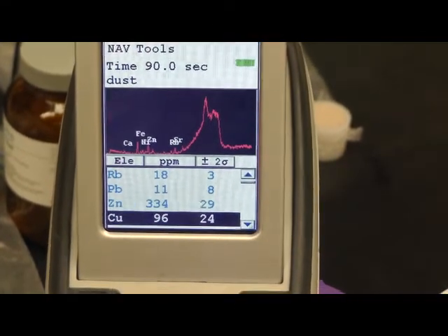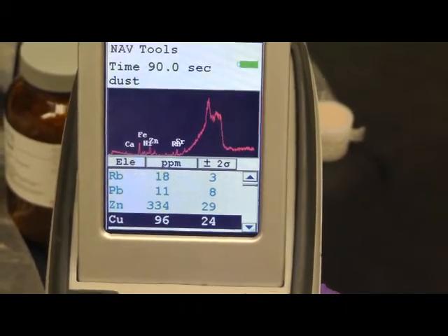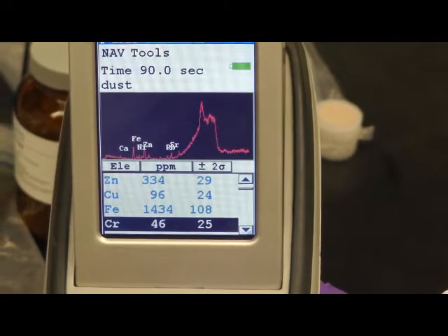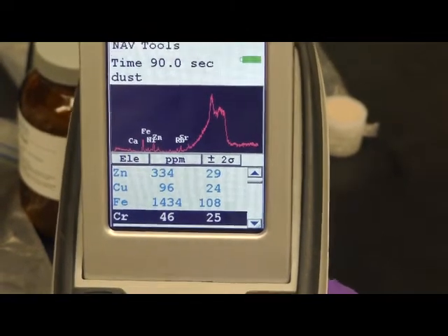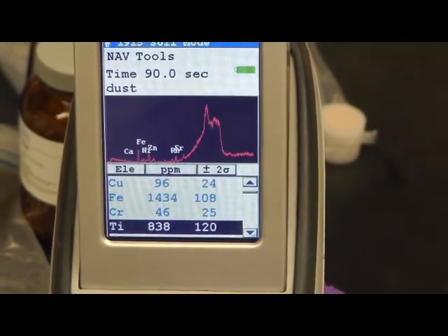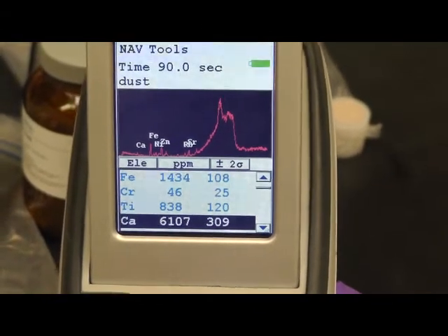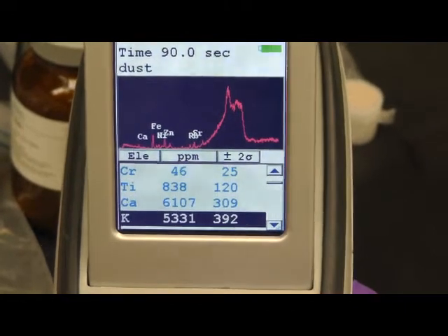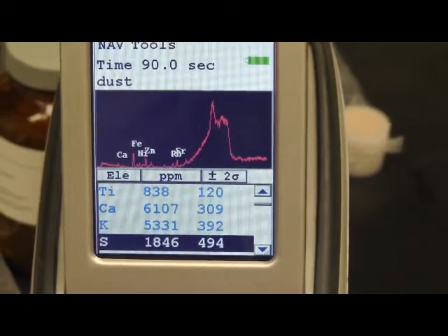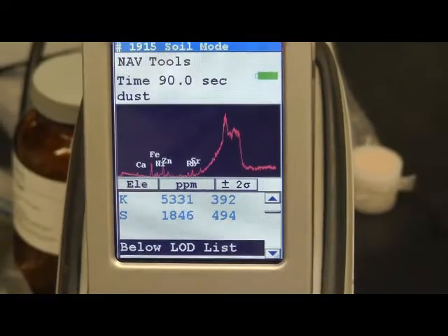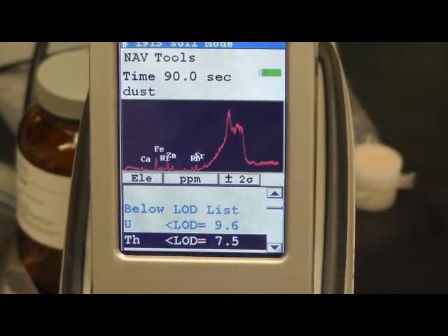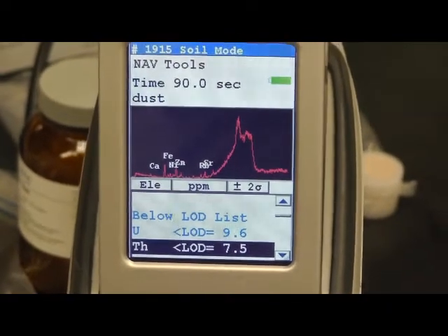Oh, there are copper as well, which is 96 ppm. And there's usually a lot of iron. And there's not as much chromium as in the soil samples. And again, there are usually lots of calcium, potassium. There's also some sulfur. So what is shown below the center is all the elements which is below detection limit.